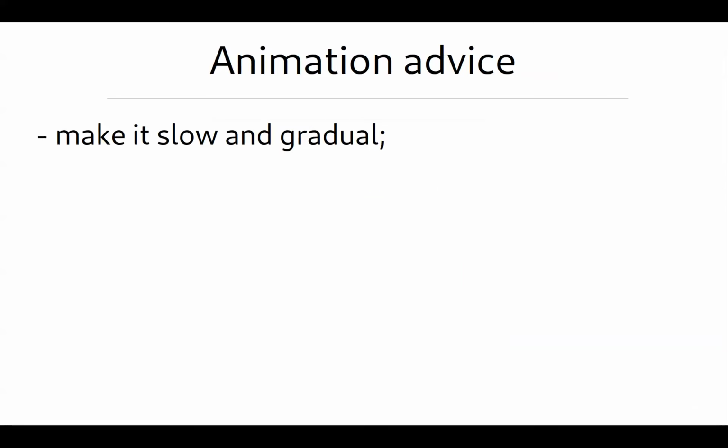So very quickly, we're probably going to do some animations. But my general advice, when people start to do 3D animations, they start to rotate things and everything becomes super 3D. So my advice is: you have looked at this data probably for a very long time, you know how it looks, but whoever is watching your movie is going to be looking at it for the first time, so really do it slow and gradual.